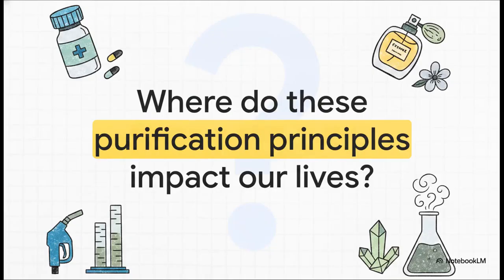We've covered a ton of ground in this explainer, from coaxing pristine crystals out of a sludgy hot solution to vaporizing heavy organic liquids at impossibly low temperatures using steam. But why does this actually matter outside the lab? Well, every time you take a safely synthesized medication that's free of toxic byproducts, every time you use a perfume extracted perfectly from a delicate botanical, or even fill your car with fractionalized fuel, you are relying entirely on the principles in this chemist's toolkit. Without these exact techniques, we'd literally just be stuck with the messy world we started with.